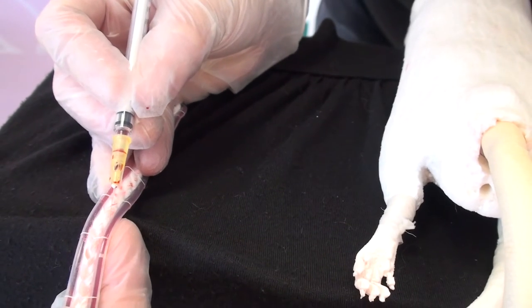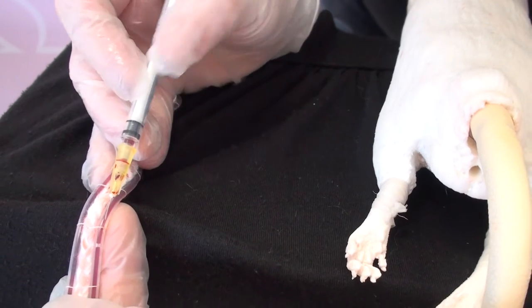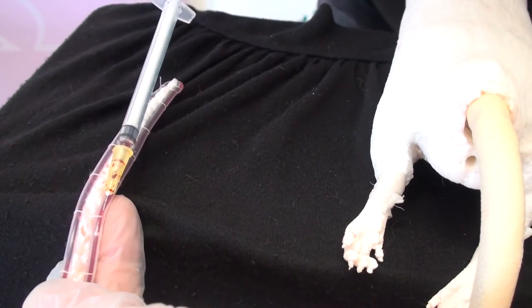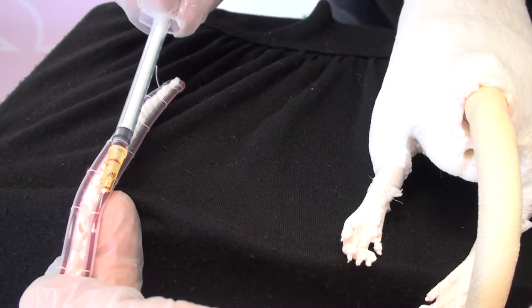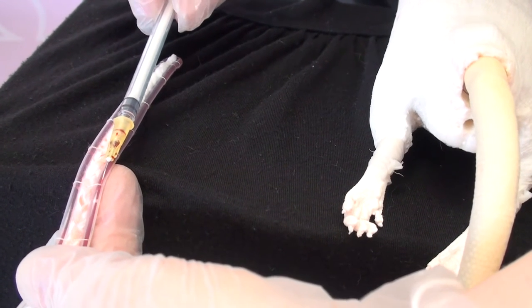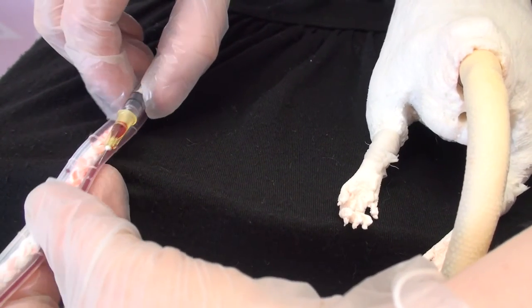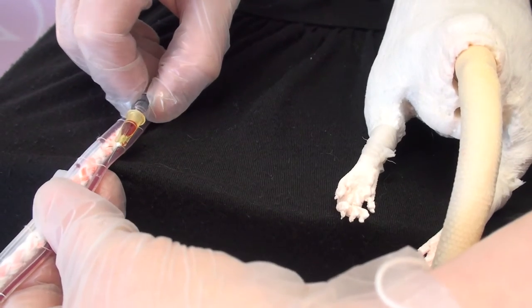Get the tip of the needle in, through the plastic and into the vein — you can kind of just feel it go pop as it gets into that vein space. Then pull back on the plunger and you should start to get a little bit of blood in there. That's what we're going for, then just gently pull that back out.